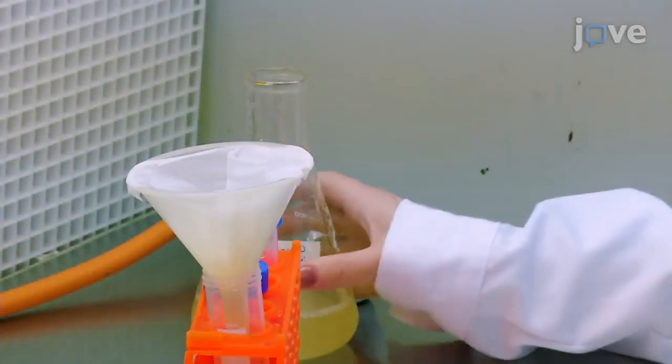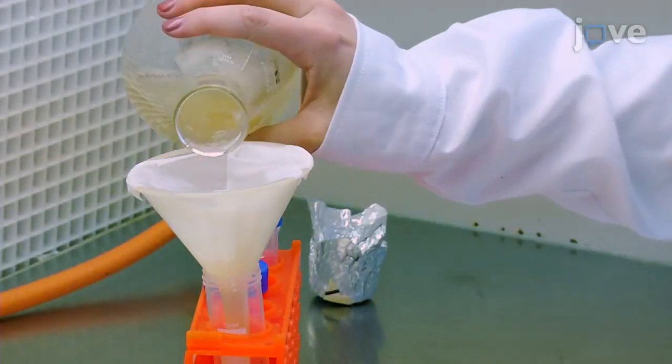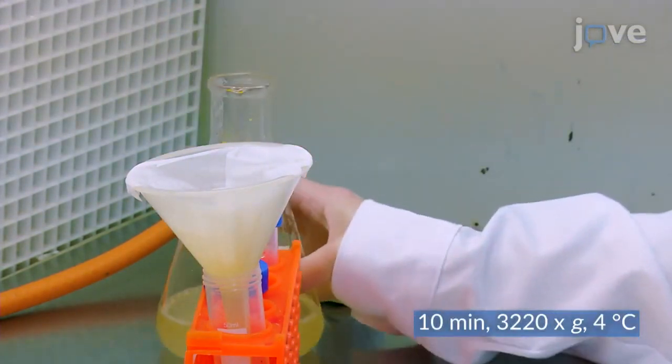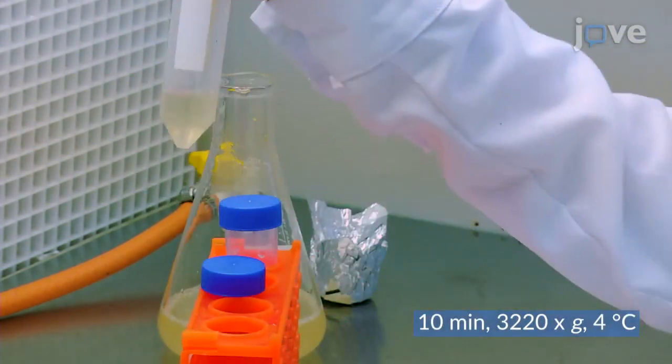To harvest the conidia, filter the liquid culture through a layer of sterile laboratory cloth into 50 milliliter centrifuge tubes for centrifugation.